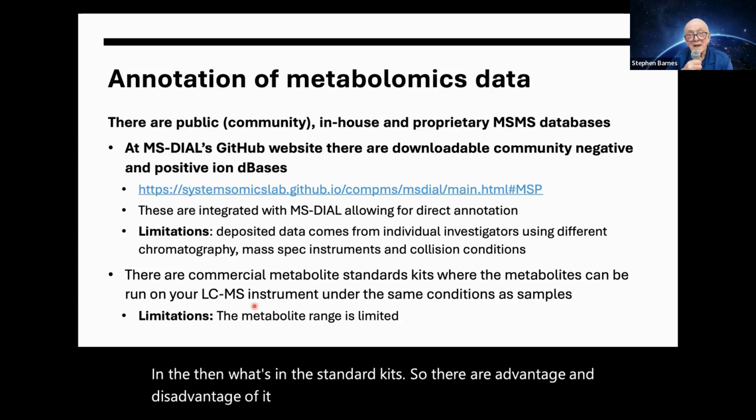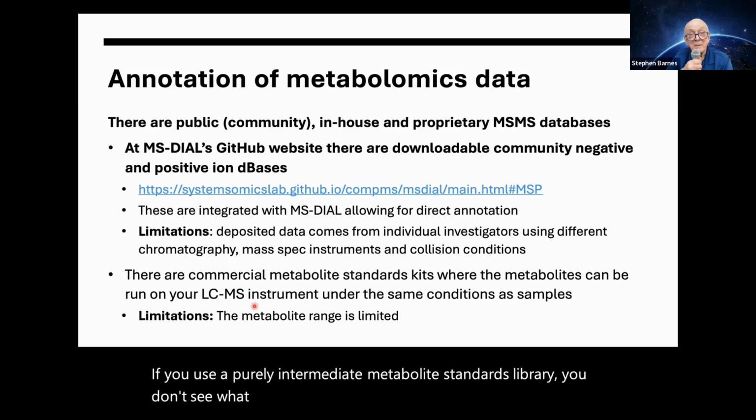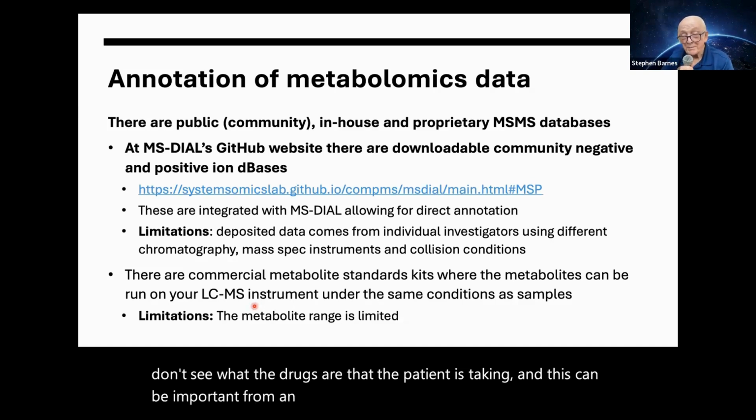If you're doing metabolomics on a patient, and you use a purely intermediate metabolite standards library, you don't see what the drugs are that the patient is taking. And this can be important from an ethical standpoint.